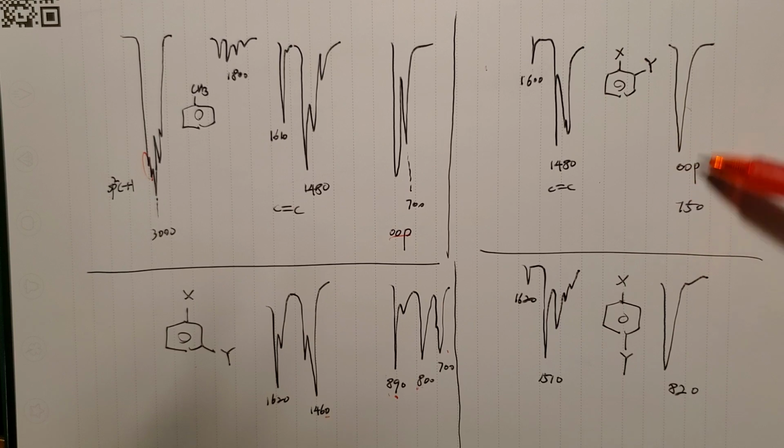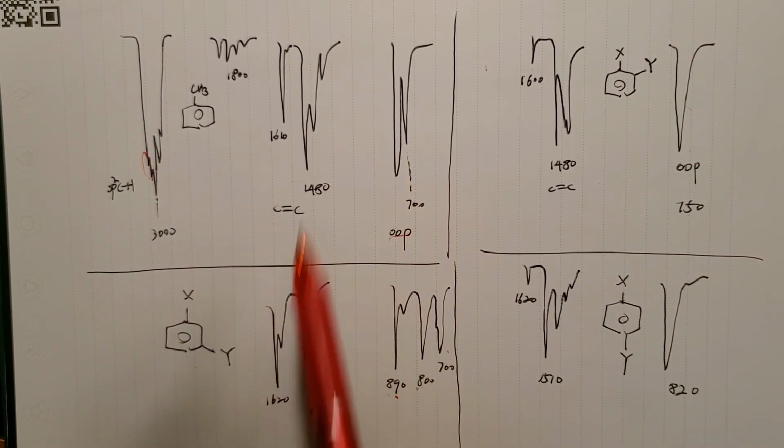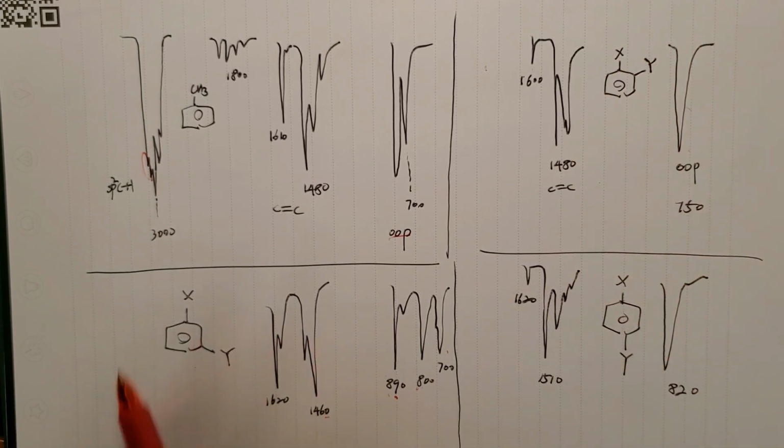Ortho and the para, out of plane, 1. Mono is slightly in the middle of these two and the meta. So if I get more requests from students, I will probably go into a little more depth, but otherwise this should be enough for sophomore organic chemistry.